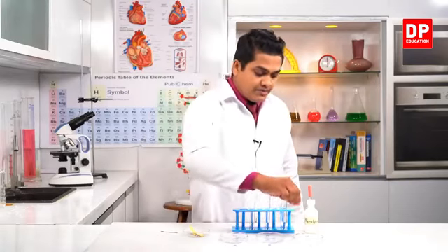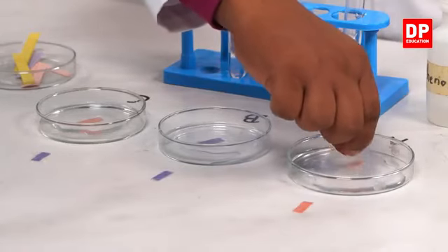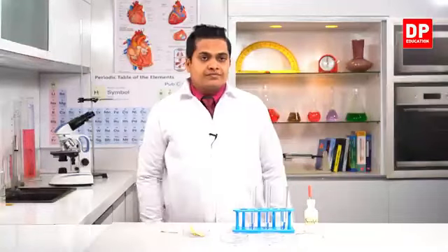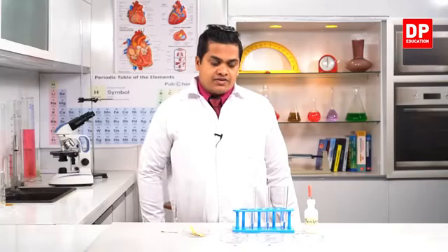So here, let's see what has happened to the red litmus. With the acidic solution HCl, actually, there is no observation. It has the original color, right? Red litmus.